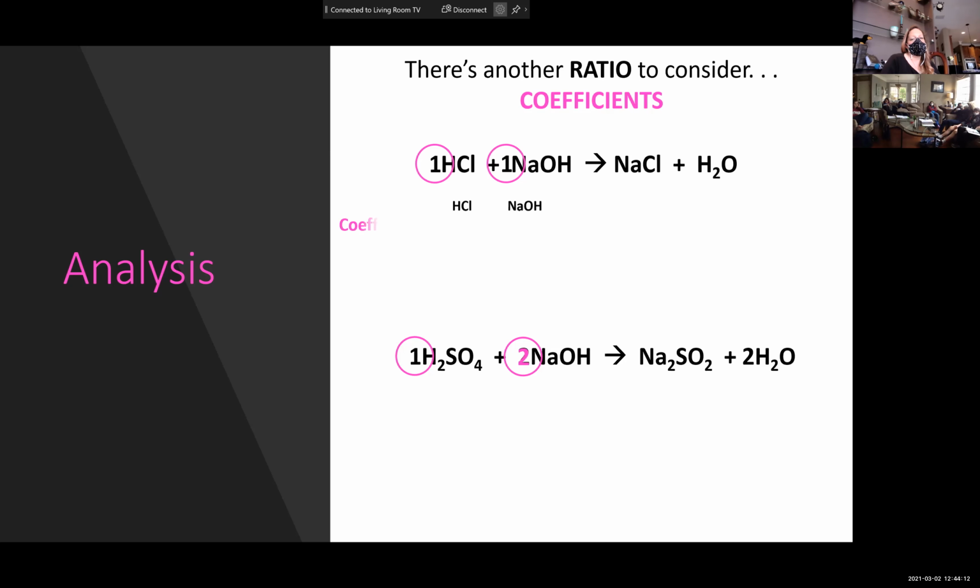So look at these ratios again. Your coefficient ratio is 1 to 1, right? Your volume ratio is 1 to 10.5. Everybody understands that? Are you sure? You know where this came from? This was the drops, remember? For every milliliter of hydrochloric acid, it took 10.5 drops of sodium hydroxide.